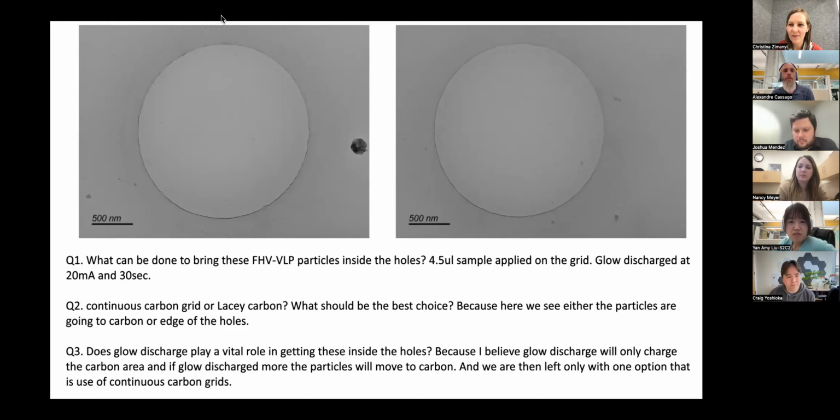And if the concentration is not a problem, if the user said they have a higher concentration in milligrams per ml, maybe they could take a look at lower magnification and see if there is a big cluster of aggregation, because then you can decrease the spread of the sample a lot. Or go back to negative stain and take a look, because when we move from negative stain to cryo-EM, we need a factor of 5 to 10 times more sample compared to negative stain.